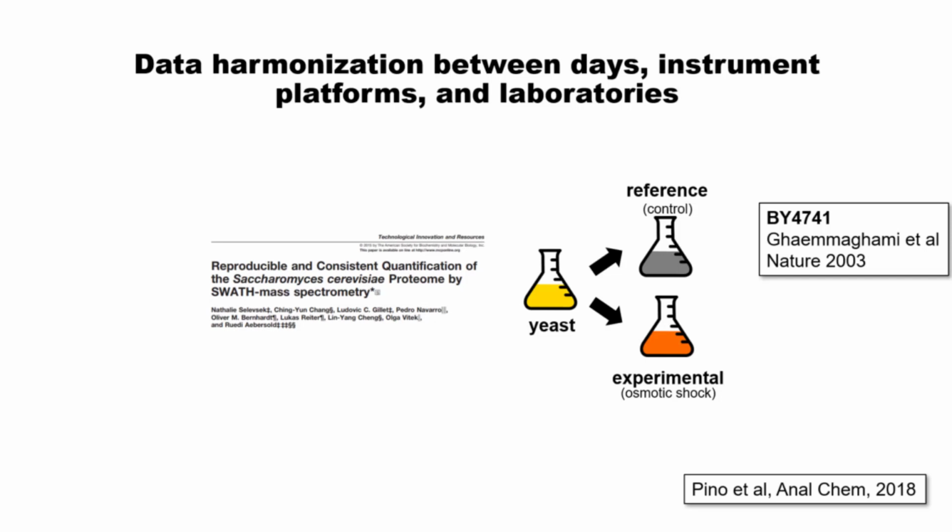They also had another experimental condition where they did osmotic shock. So basically what our goal was is, could we use this as our calibrant, as a common reference? Could we grow up our BY4741 strain? And could we calibrate our osmotic shock quantities relative to this and put it on a copies per cell, because this values of each protein that's in there has a quantity that Sina Ghaemmaghami has derived it to be as a copies per cell.